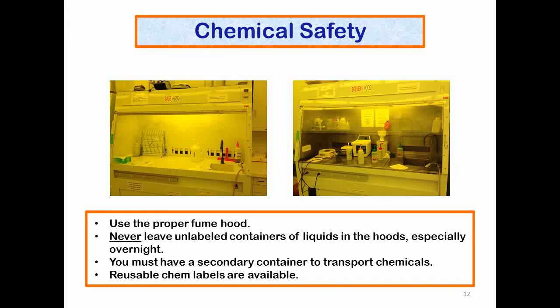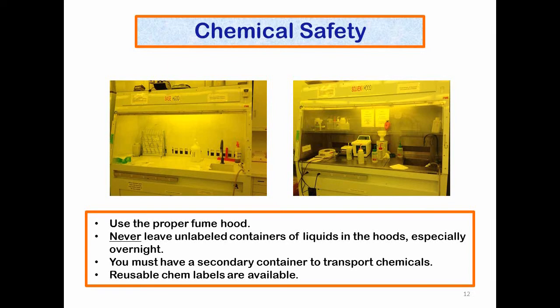Regarding chemical safety at MNTL, we have several kinds of fume cupboards for bases and fume cupboards for acids, as well as solvents. Always be aware to use the proper fume cupboard and never leave unlabeled containers of liquids in the hoods, especially overnight. Anything that is left unlabeled will be removed, and the glassware removed as well.